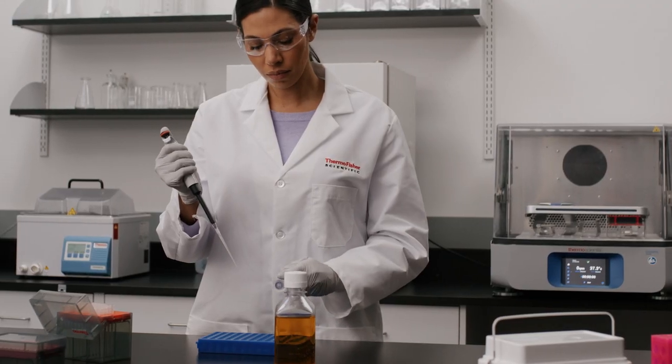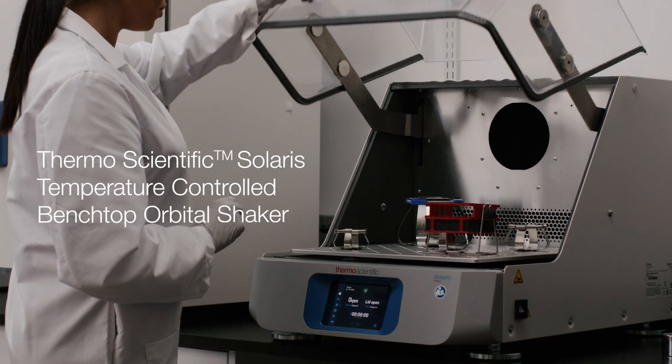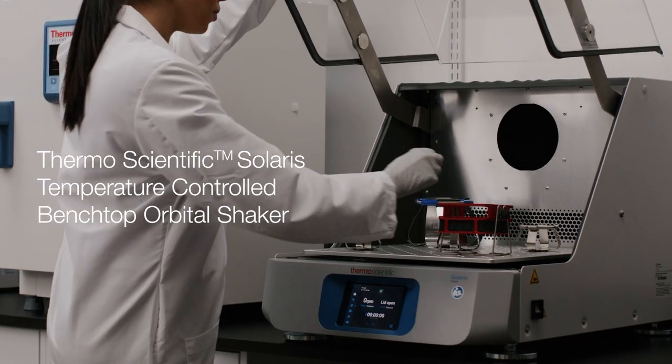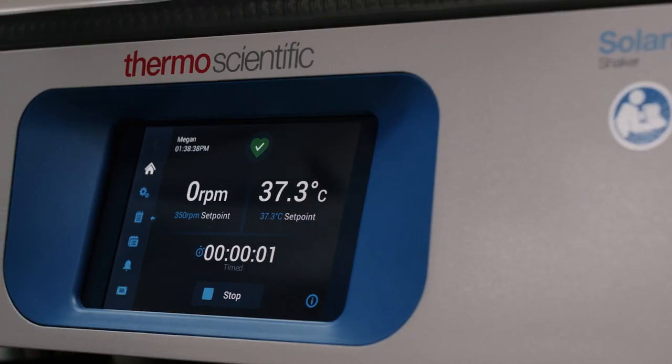Notice how Maria removes the sample, adding extra media to the tube before placing it in the ThermoScientific Solaris benchtop shaker. The sample will stay in the temperature-controlled shaker for one hour at 37 degrees Celsius.